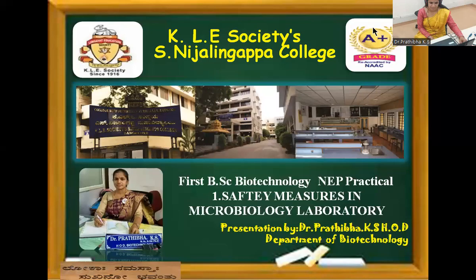Good morning, students. Today in this lecture, you will understand safety measures in the microbiology laboratory. I'm discussing this as per the first year, second semester BSc Biotechnology NEP practical syllabus. Before going through the NEP practicals, we must first understand safety measures in the microbiology laboratory.